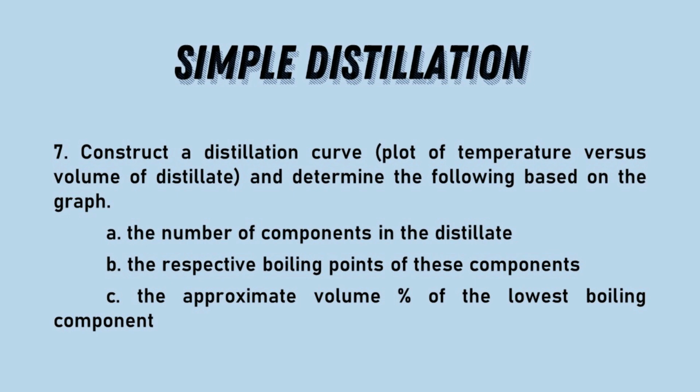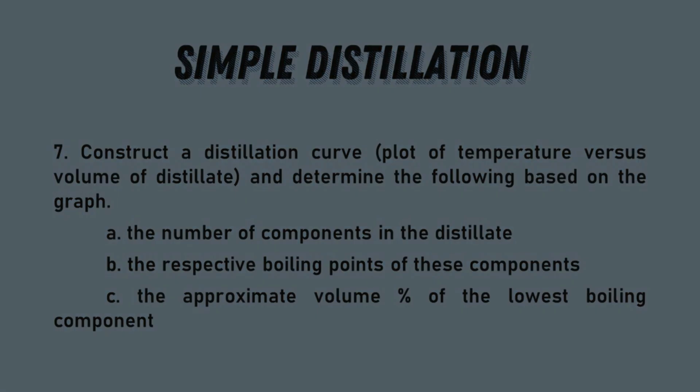Construct a distillation curve and determine the number of components in the distillate, the respective boiling points of the components, and the approximate volume percentage of the lowest boiling component based on the graph.